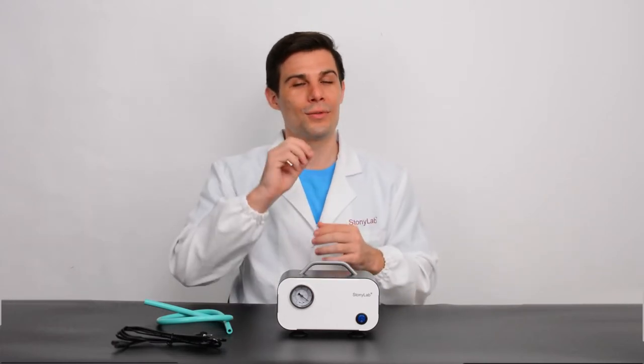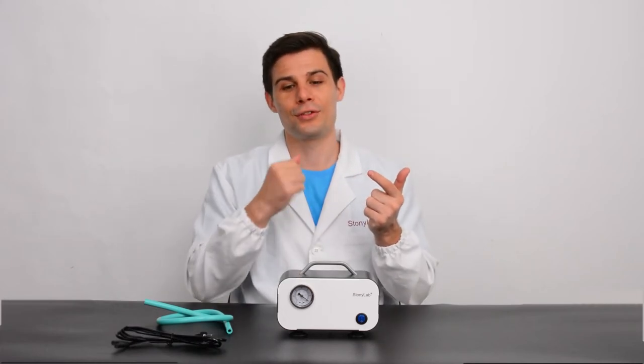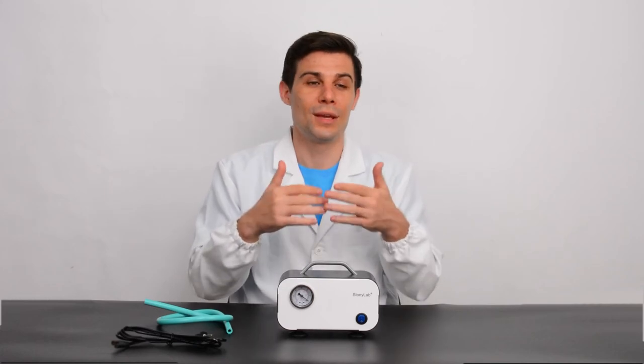This pump is also a great choice for evaporation, distillation, solid filtration, vacuum desiccation and solid phase extraction, and maybe other lab work.